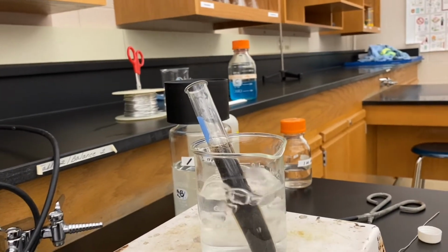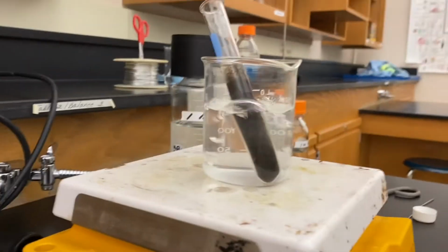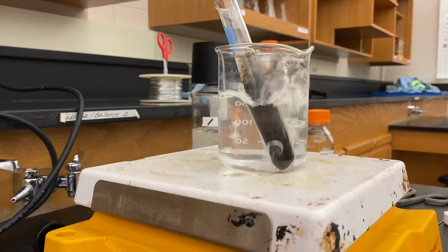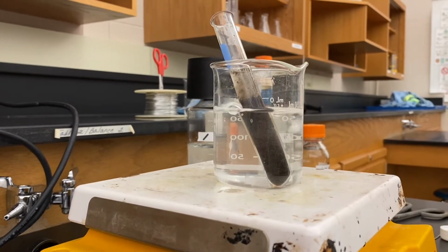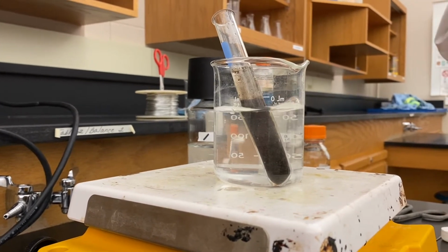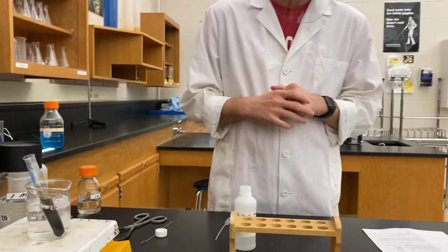Alright, so that is our second reaction, the formation of the copper 2 oxide and water. Again, on your own sheet of paper, you're going to write reaction 2 and give me the balanced chemical reaction for that second reaction in the test tube.